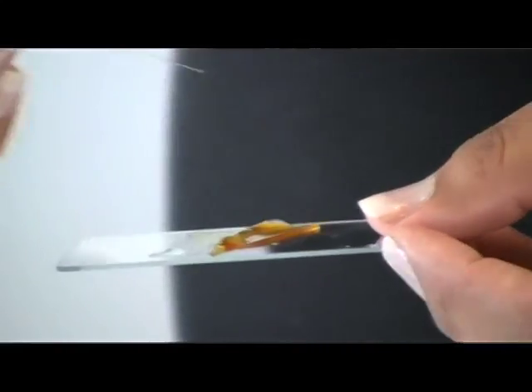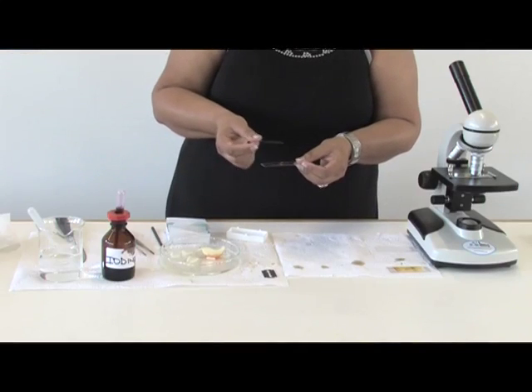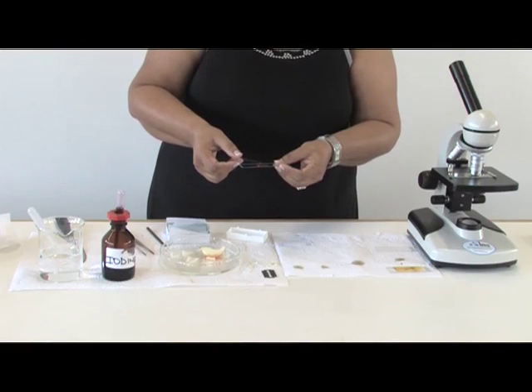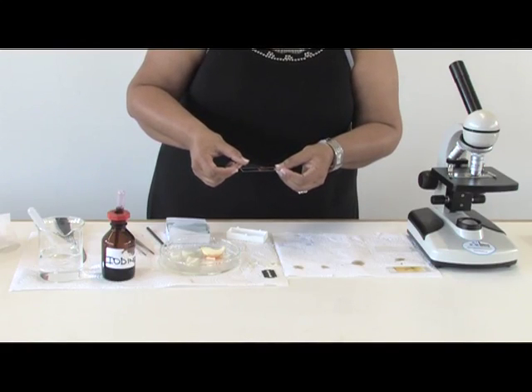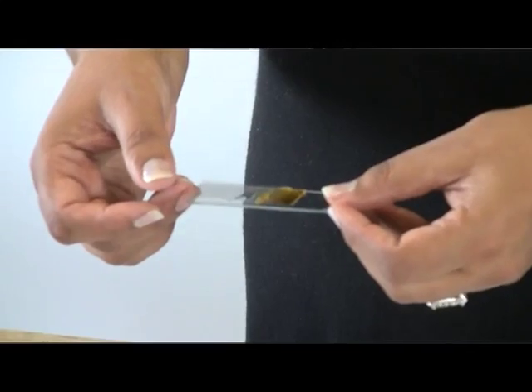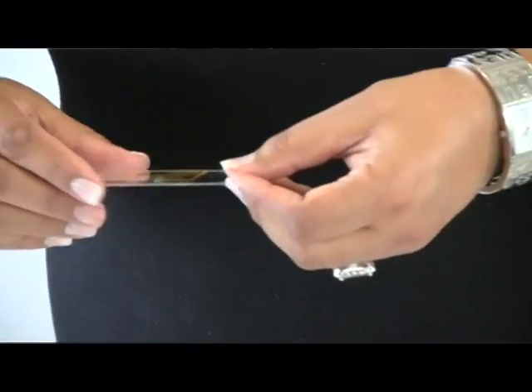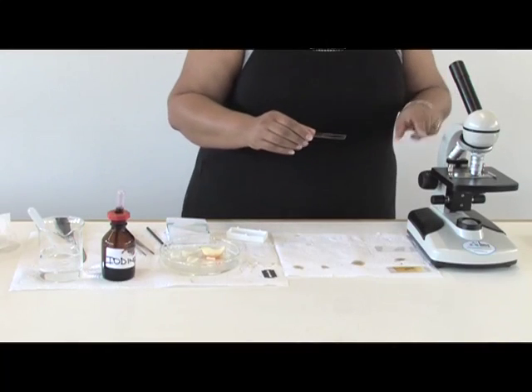With the cover slip, you have to work very carefully. Normally, if it's smaller than this, use a safety pin or something and from the one side you slide it and put it down carefully so that you can prevent any air bubbles from forming — otherwise you won't be able to view anything.